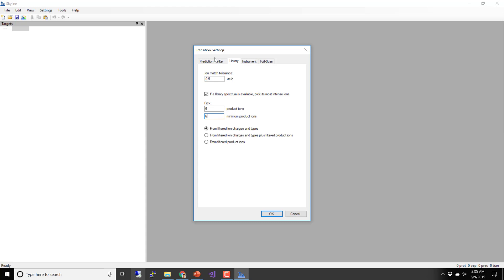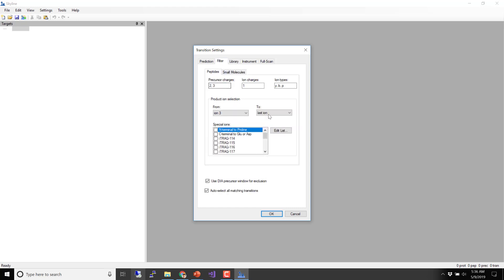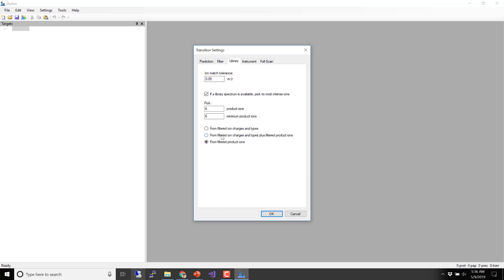For the ion match tolerance: usually with something like an Orbitrap, we would make it 0.05, which is still about 50 ppm. The 0.5 default was for an LTQ — it's an original default from when we had a lot of ion trap spectra. So 0.05 is definitely more appropriate in modern times. To get Skyline to respect skipping ions 1 and 2, we have to tell it to use filtered product ions — otherwise it just skips the filter and uses all product ions.